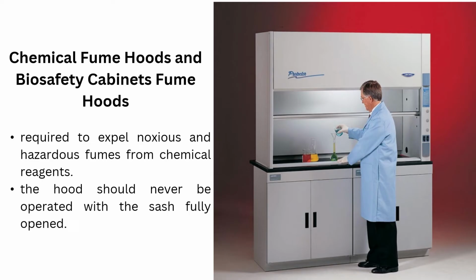Chemical fume hoods and biosafety cabinets. As for fume hoods, class, they're required to contain and expel noxious and hazardous fumes from chemical reagents. Fume hoods should be visually inspected for any blockages. A piece of tissue paper placed at the hood opening will indicate airflow direction.